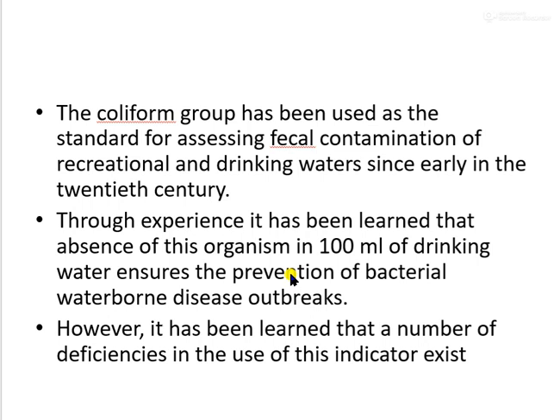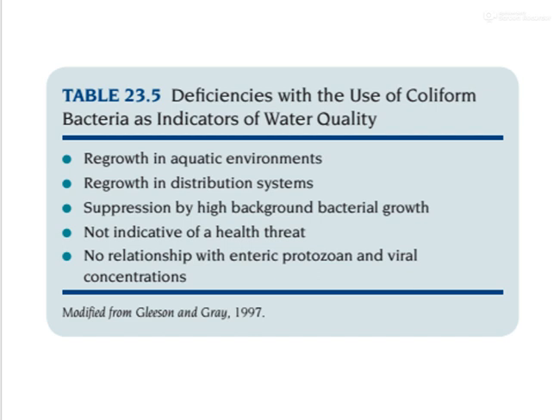So if you find coliform within your water body, it indicates that your water body of study is having a fecal contamination. Though we use coliform bacteria as indicators, of course sometimes some deficiencies also do occur in this test, because regrowth happens in the aquatic environment, regrowth happens in the distribution systems, and sometimes suppression by high background bacterial growth could happen.